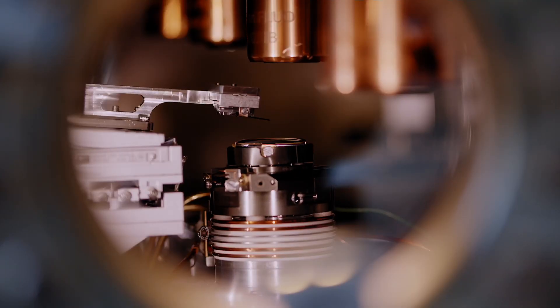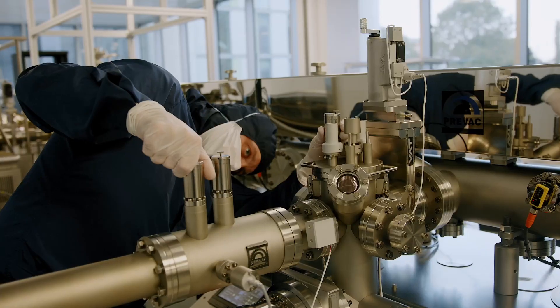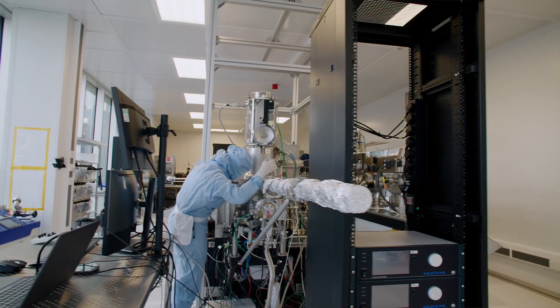The UHV system will help enable key applications where 2D materials can really shine. For example, healthcare applications, quantum computing, aerospace devices. We're also collaborating with quite a lot of industrial partners that are interested in this technique.